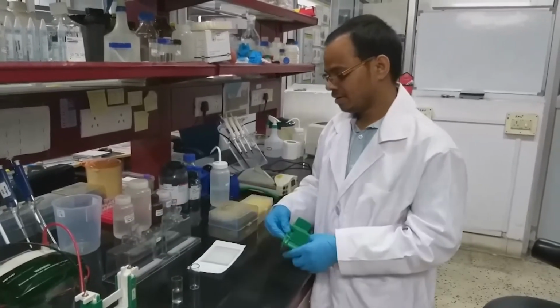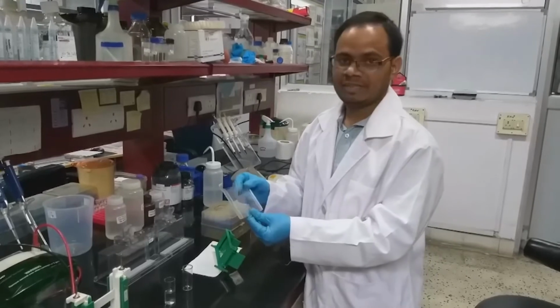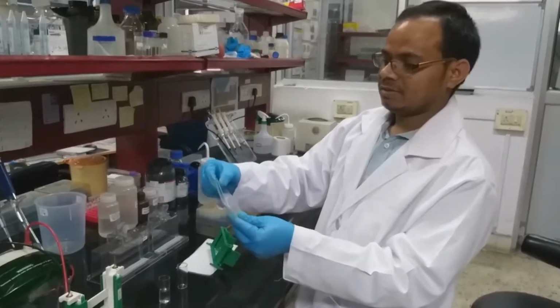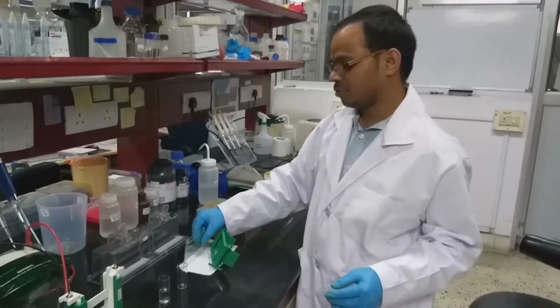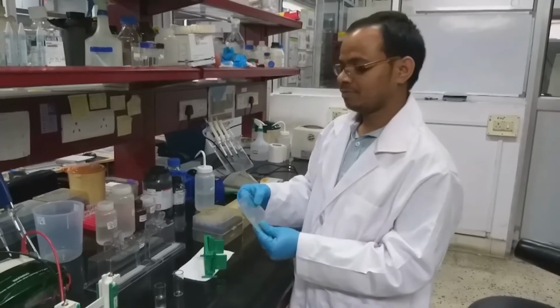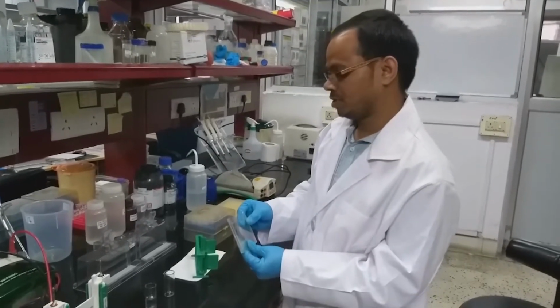Here we use these glass plates to prepare the gel. In between there is a space where we can pour our gel solution. Then we keep it for at least 20 to 30 minutes and let it solidify. Then we will prepare the stacking gel, and then we will load our protein solution.